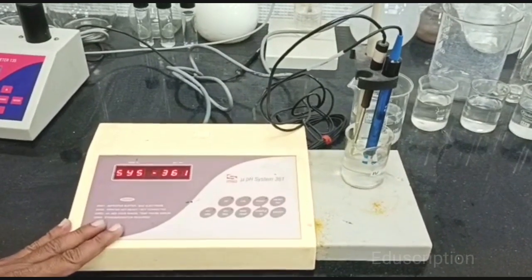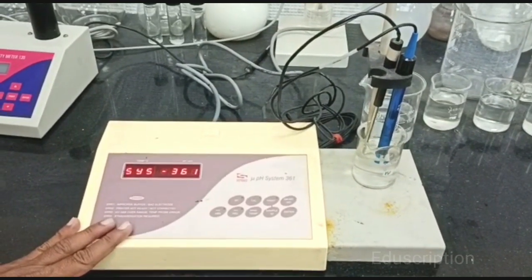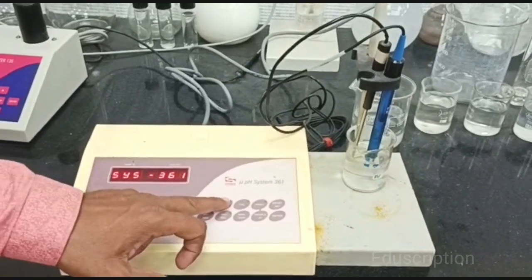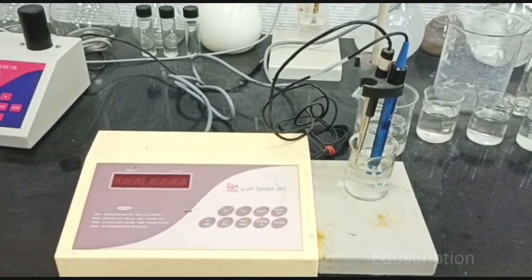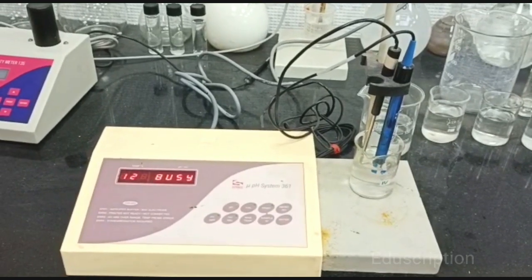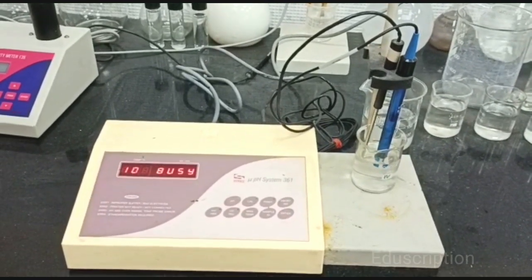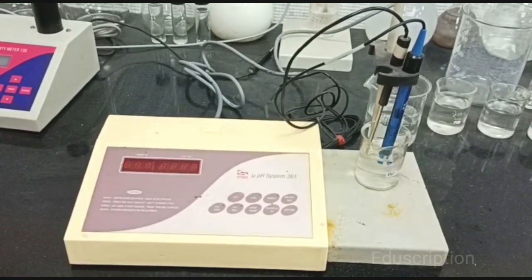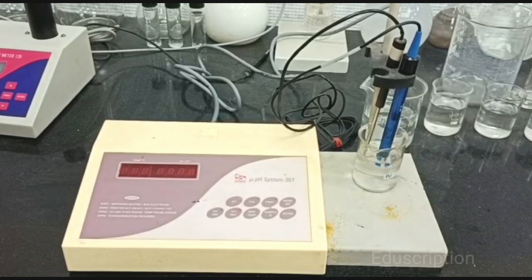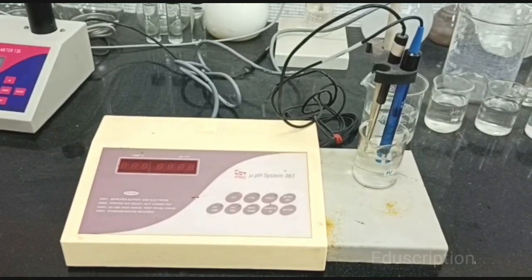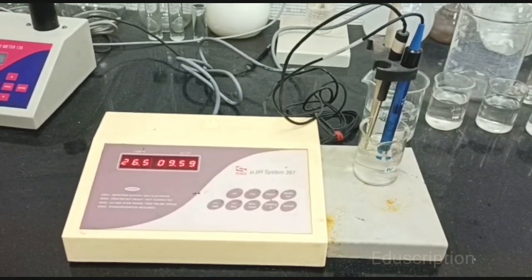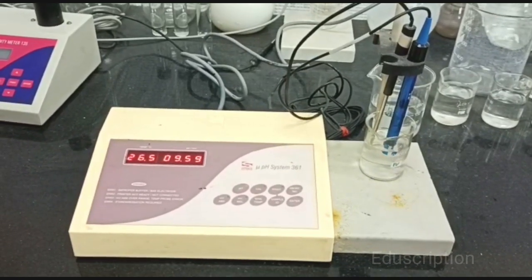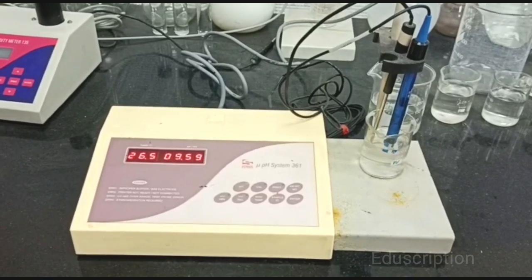Now we will detect the pH value of last beaker solution. So press pH key and then enter. Now see or observe the pH value of fourth beaker is 9.59.